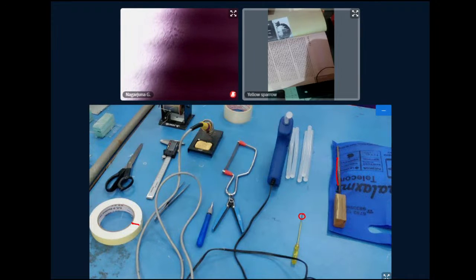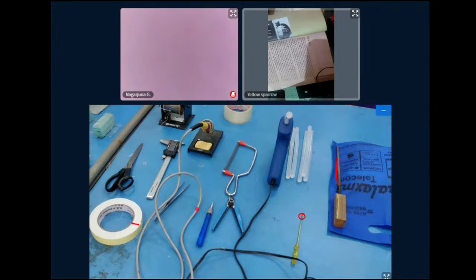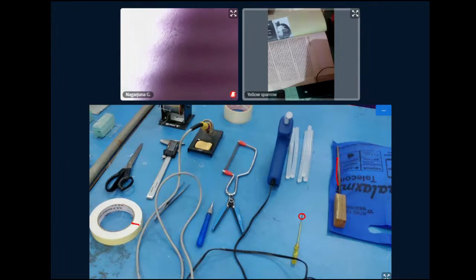Very interesting. And I think there is a vernier caliper also, just behind the scissor. Yes. When you are playing with your lens assembly, you have to measure its diameter so that you can easily fit the red gear on it. You can precisely calculate that diameter with the help of this digital vernier caliper. It is not necessarily a required tool, though.